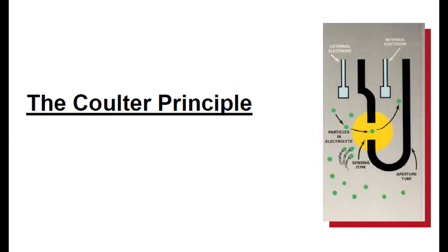The Coulter Principle is something that was developed by Wallace Coulter and patented by him in the early 50s, but really the invention was resolved in the late 40s. It was a very elegant solution for individuals who had to slave over microscopes staring into small optical fields and count cells for hours at a time.